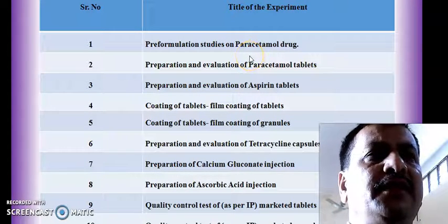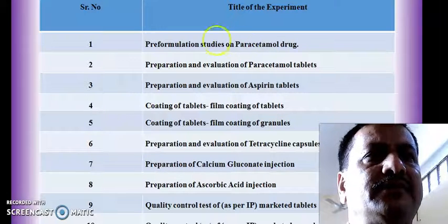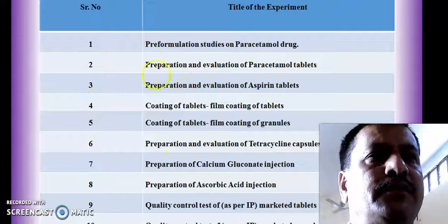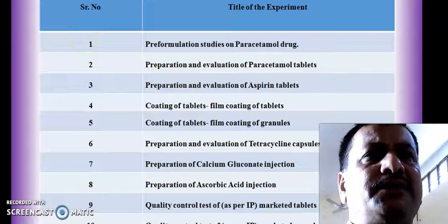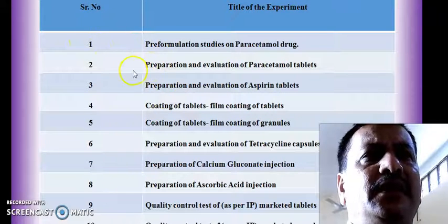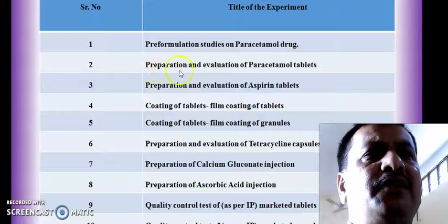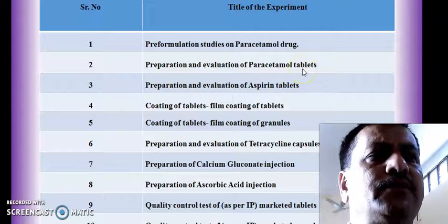In this we are going to study certain organoleptic characteristics, then flow properties, then we are going to see the densities such as tap density, bulk density, and poured density.